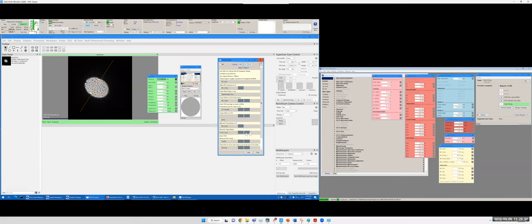Okay, it's almost perfect. And then you want to stop the wobbler, because the movement is clear if we reduce the defocus. So I want to change to a smaller defocus. Okay, and see how I can judge the movement now. You can see I can see some movement along the X.